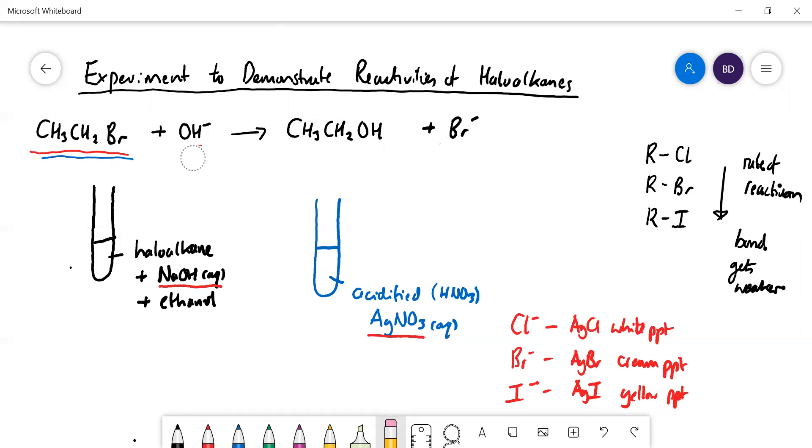Let's have a think about what we've got in these test tubes. We have the haloalkane, we've got sodium hydroxide as a reagent. Why have we got ethanol? That is because the haloalkane doesn't mix very well with water, so it's to enable the haloalkane to mix with the aqueous solution.